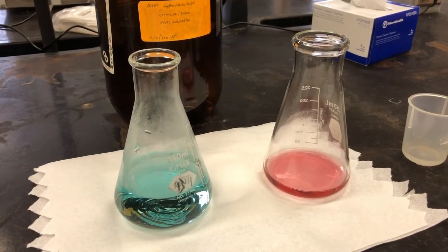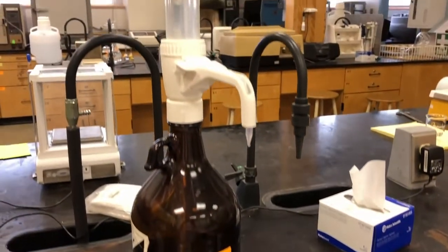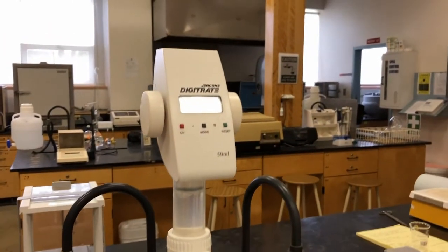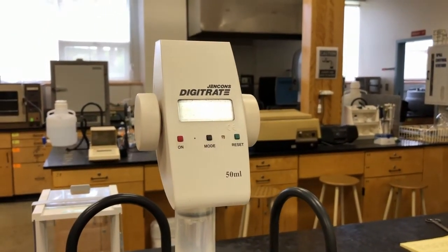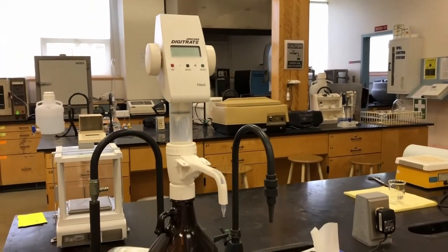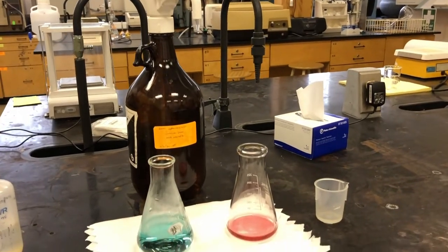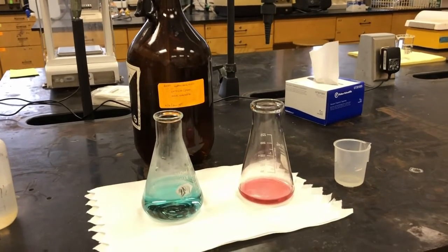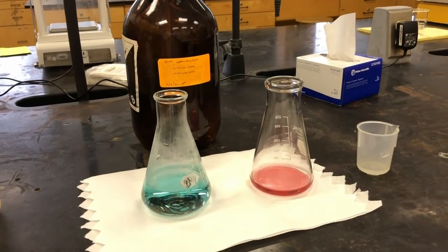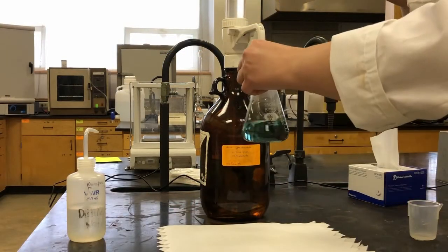So now we're going to titrate this with a solution of hydrochloric acid. So we're using a digital titrator, rather than a burette. And we're going to titrate that with hydrochloric acid, and the volume of the titrant that we use is the value that we'll use in our calculations to determine the amount of nitrogen in the sample. Okay, so let's start the titration.